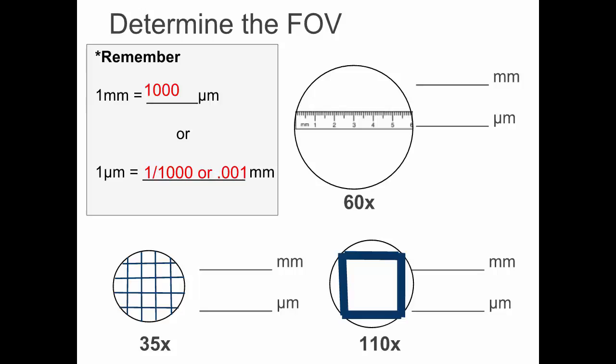6,000. 6 what? Veggie burgers? No. 6 millimeters. I hear different things. 6,000 millimeters. Or 6 millimeters. Correct. So 6 millimeters. Okay, each numbered line is a millimeter. So it's 6 millimeters across, or that is equivalent to 6,000 micrometers.